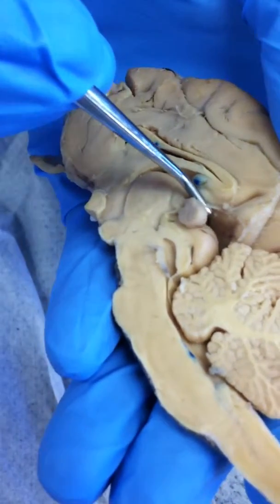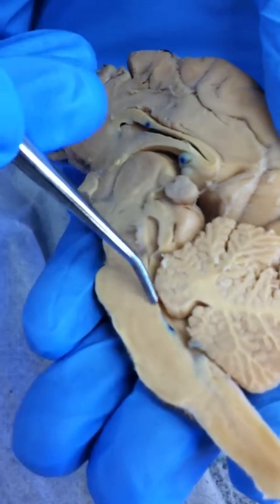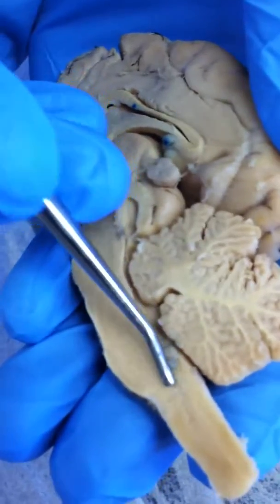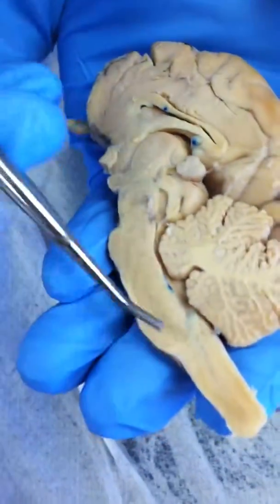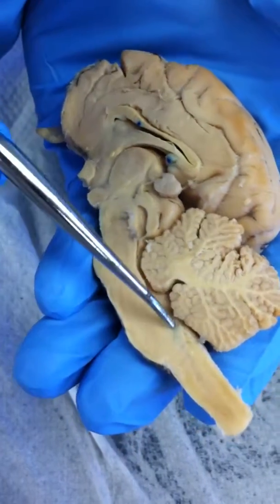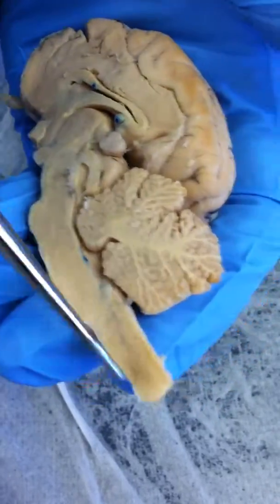Then it follows this cerebral aqueduct, right? And then into the fourth ventricle, where it comes out. It goes into the spinal cord, and it'll either come out to the side so that it stays in the brain, or it'll go down into the spinal cord because cerebrospinal fluid is in the brain and in the spinal cord. So, in the spinal cord, it'll fill in the subarachnoid space as well as the dural sinuses.